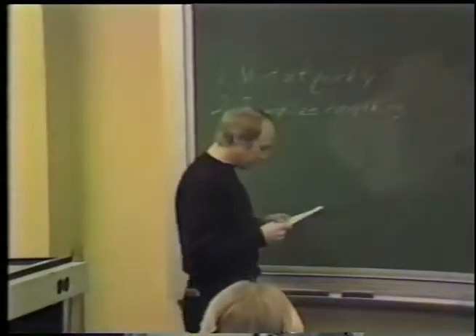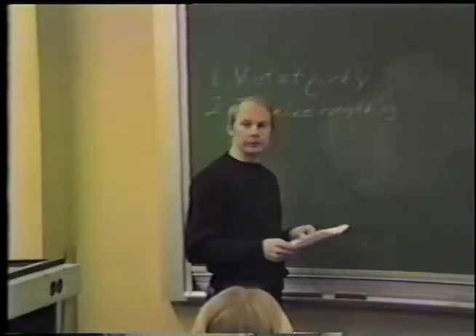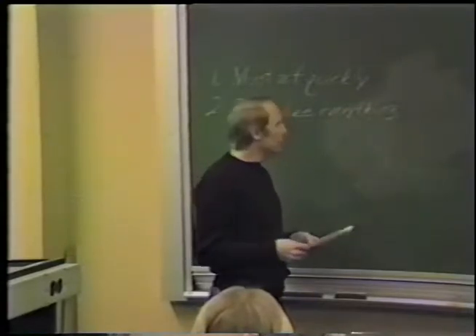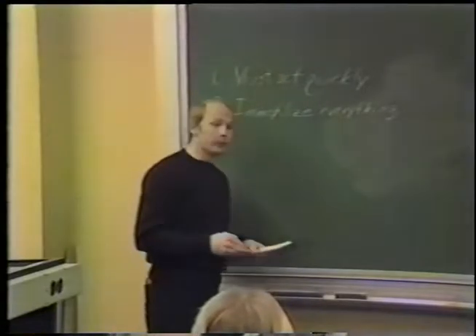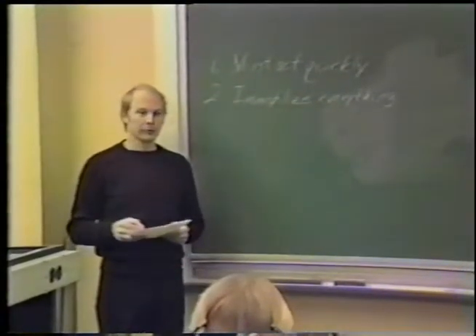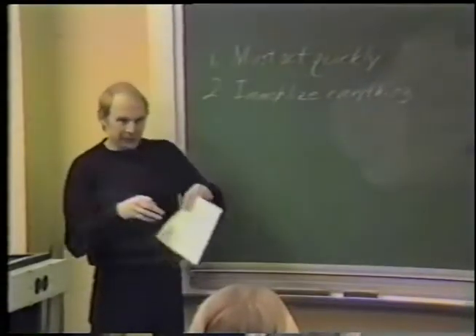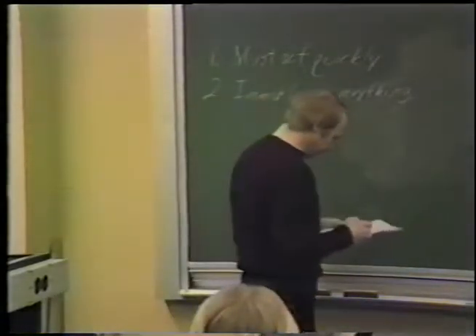Osmium tetroxide, on the other hand, will fix lipids and anything else with a double bond, but it's very inefficient at fixing proteins, nucleic acids, and saturated lipids. And this selective reactivity may contribute in large part to the observed slowness of the system. Anything that can't be fixed by the fixative has to be gradually trapped in that matrix as the fixative fixes in place whatever it can. Okay?